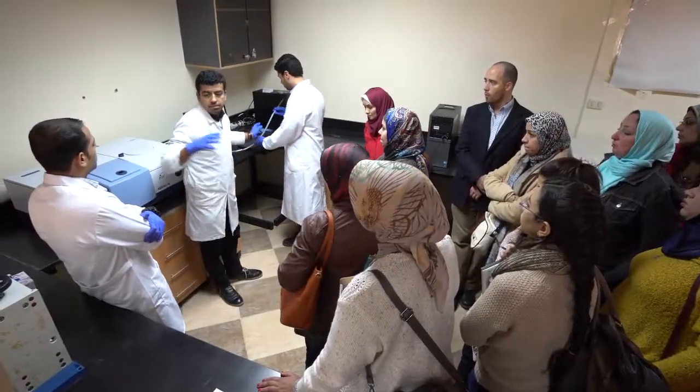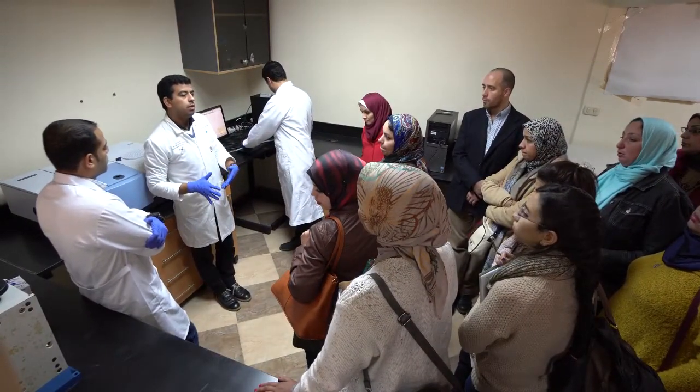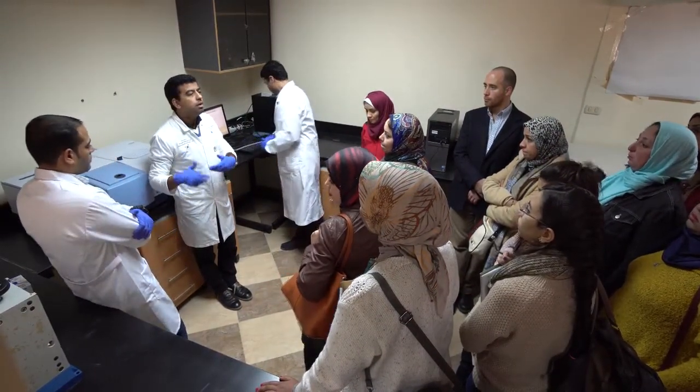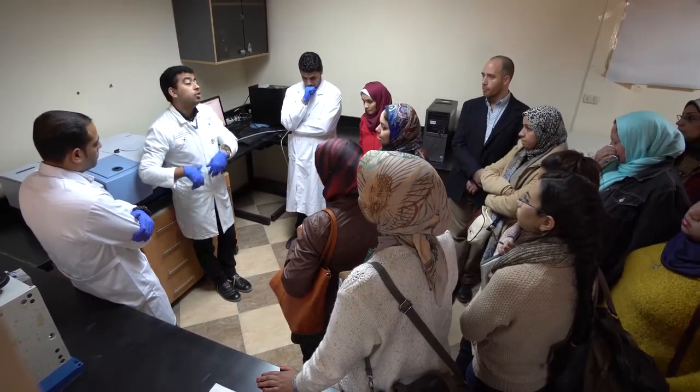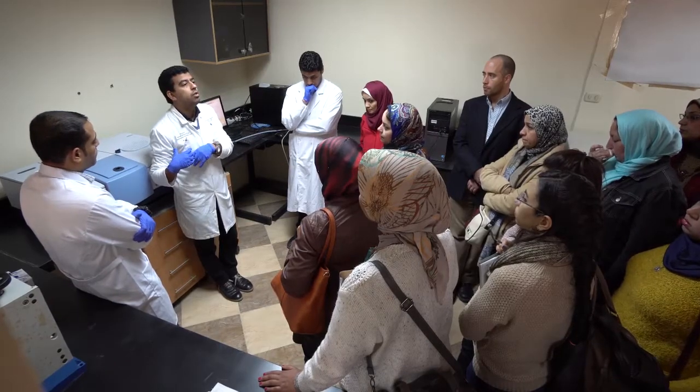So in coming here today, my focus is to try to explain how we can use a technique, FTIR, to understand materials better. My colleague Osama will teach you the process of making the KBr sample and how to analyze this using our equipment.